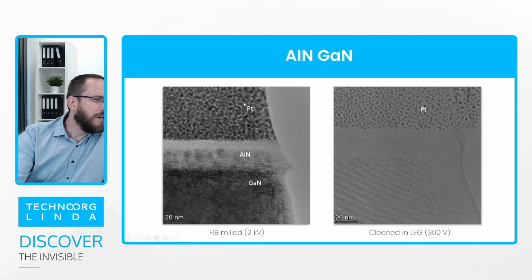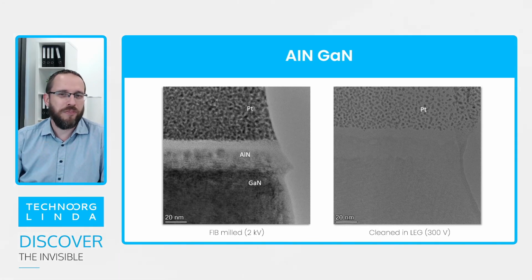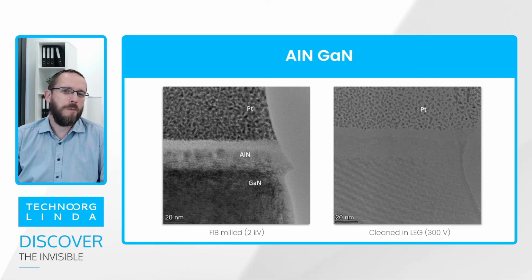It's very important that they are not overlapping, like they are overlapping in the... Oh, where is my mouse? Sorry. Yeah. So here, a lot of platinum particles are overlapping in the TEM image. Here we have them just next to each other. So this indicates that the sample thickness is down to about 5-10 nanometers, which is very important. This demonstrates that we can reach such very small thicknesses and still maintain sample stability.